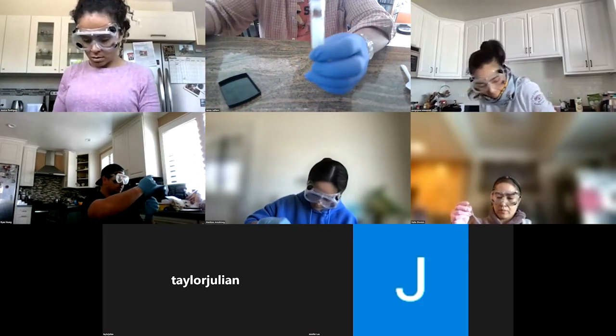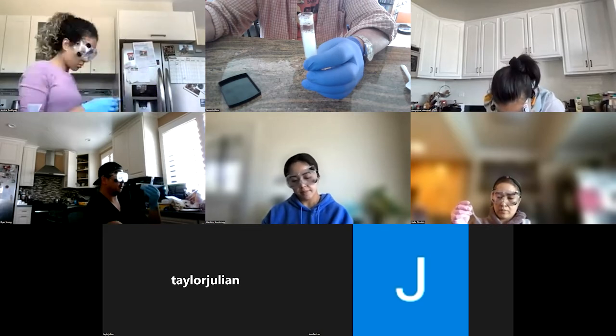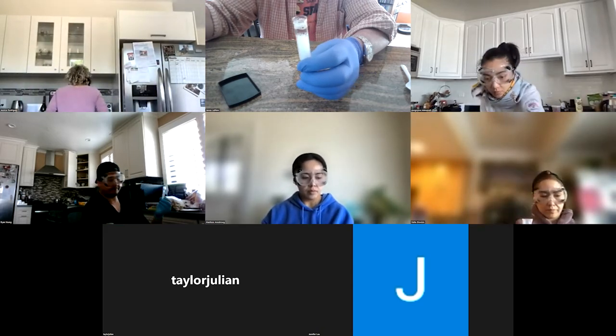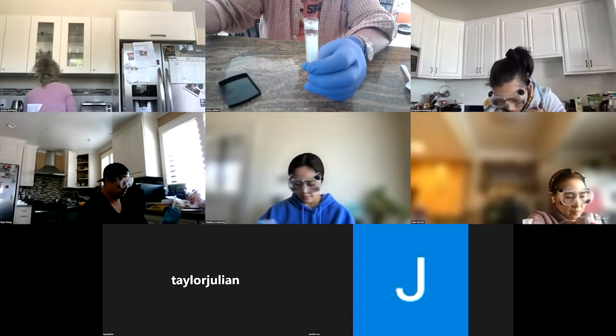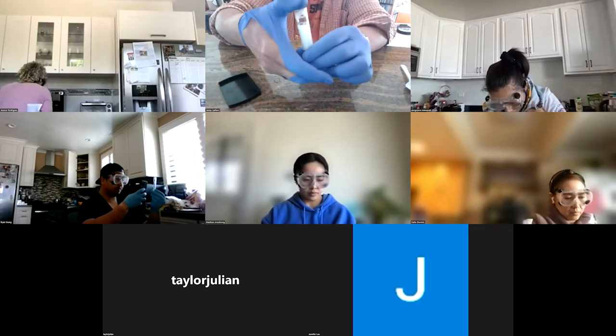So then take a picture of that. Also put your vegetable oil in. And give that a shake.